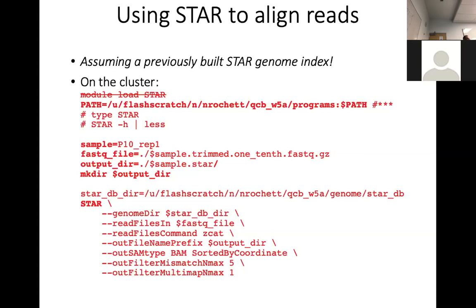Okay, so let's work five more minutes on this. And if you see STAR running, then you're good. So I just made that correction. Yes, that's running. Previously it did update on this. So instead of having this, you have this directory.